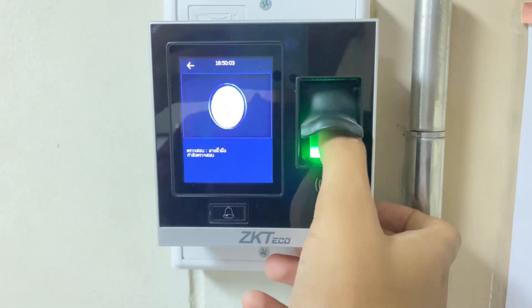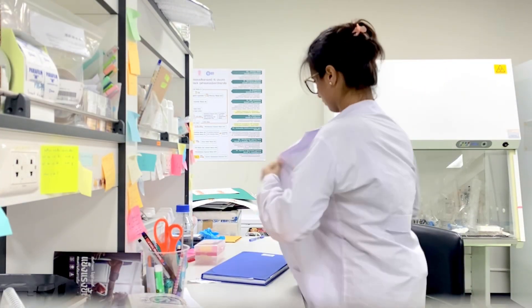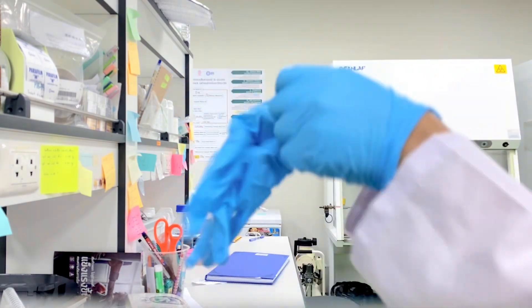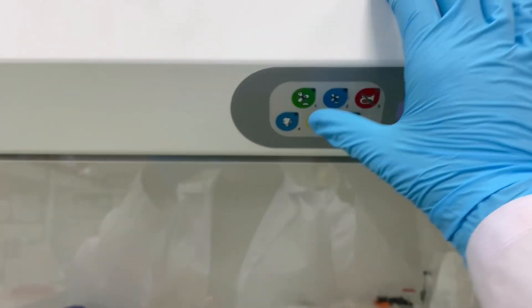Welcome to another day in the lab. Today I'm going to seed myself for MTT assay. First thing I'm going to do is wear the lab coat because it's going to protect me from any spills, and then I'm going to wear gloves. I always UV before using the cabinet as a precautionary measure, and after that I'm going to rub alcohol on my gloves.